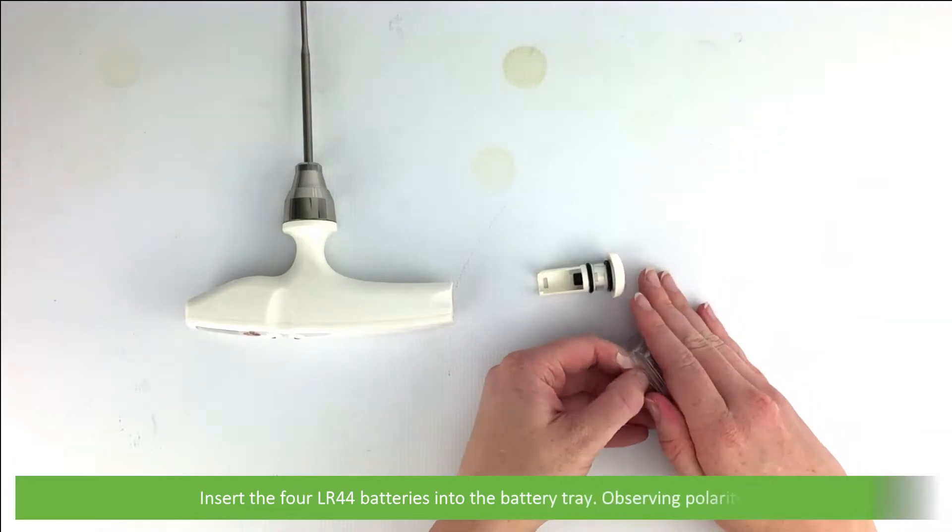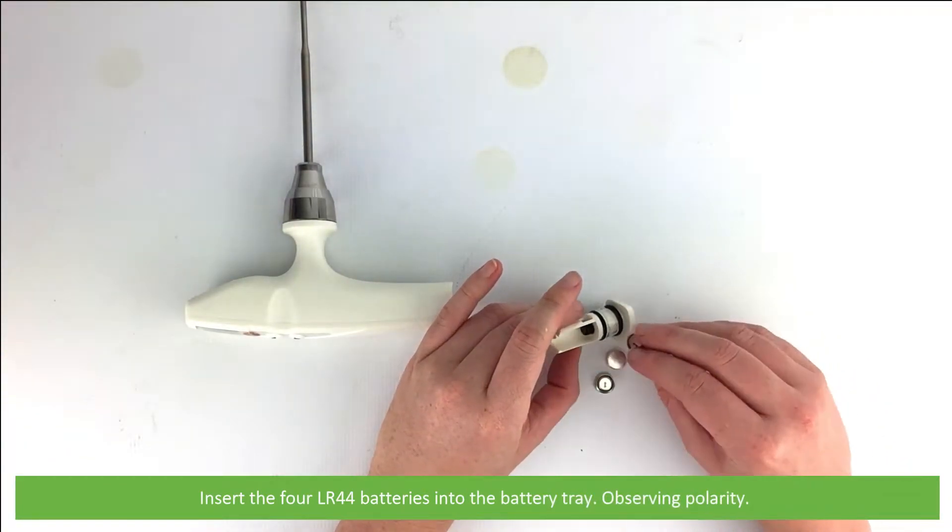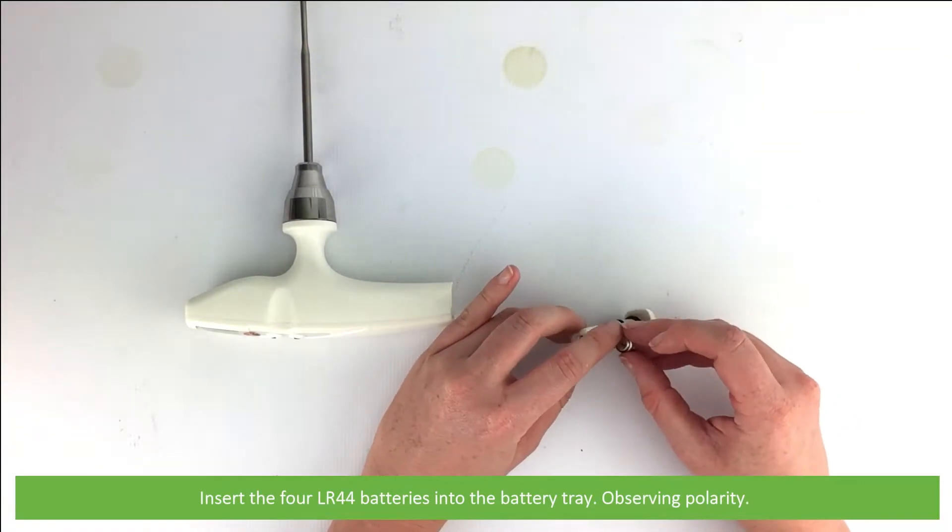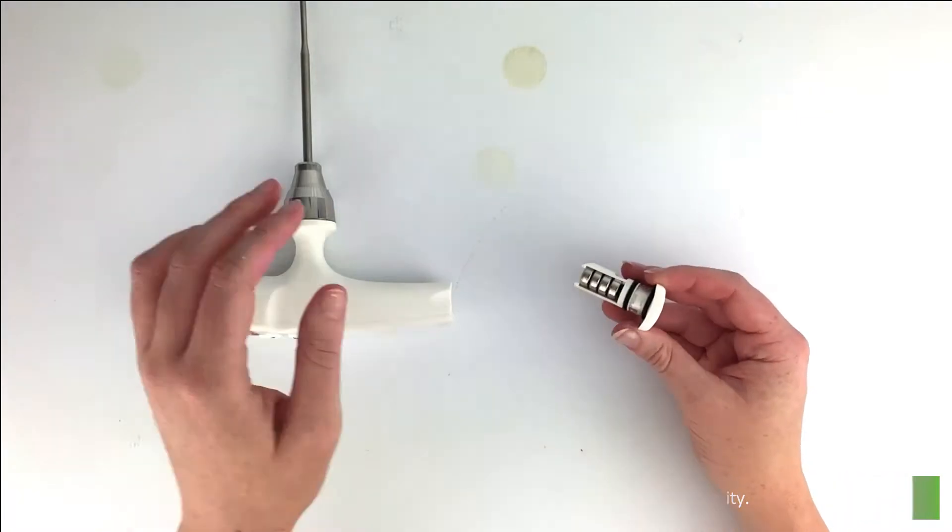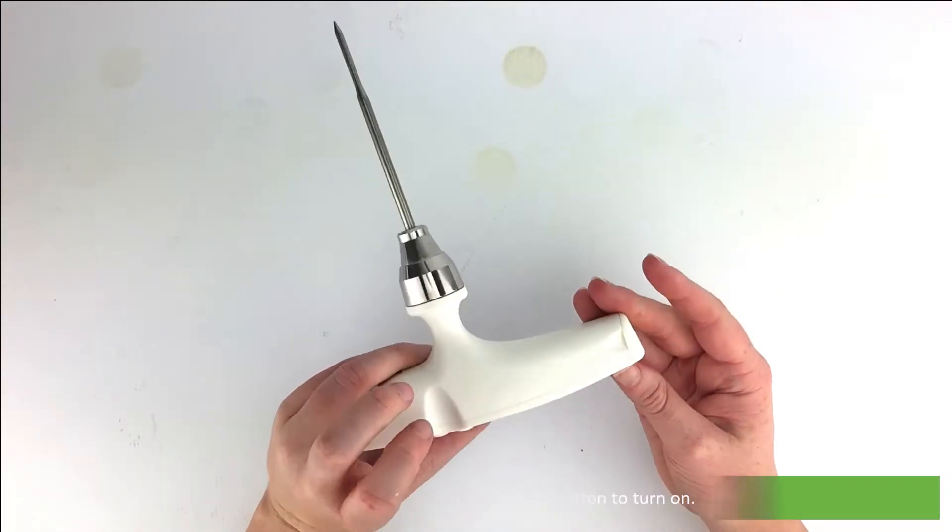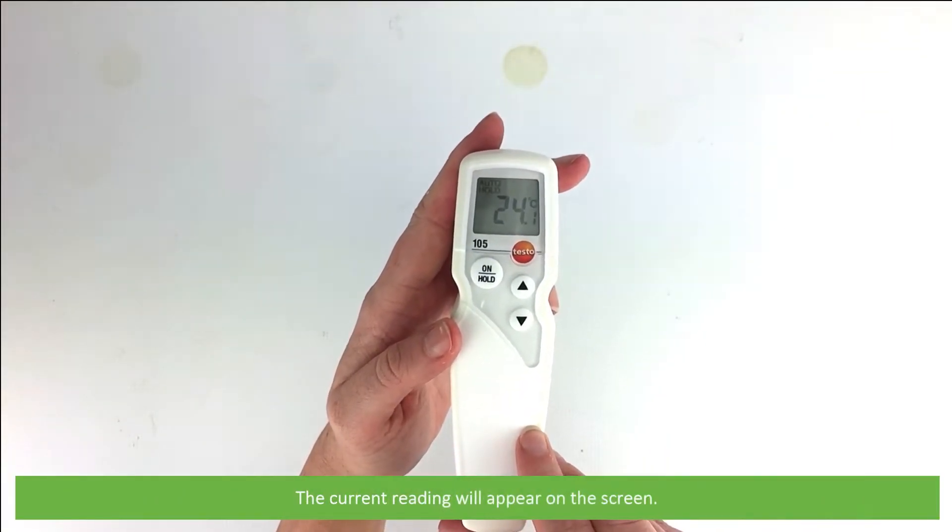Insert the four LR44 batteries into the battery tray, observing their polarity, then reinsert the tray and press the power button to turn on. The current reading will appear on the screen.